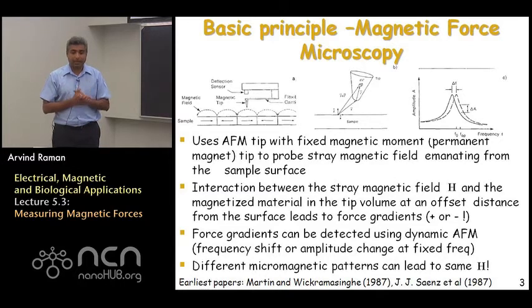This needs to be taken into account, which is why, when one deals with magnetic force microscopy, modeling the interaction of the tip with the magnetic fields and understanding the connection between the structure of the media and the magnetic fields created by it are essential to interpreting the whole image.